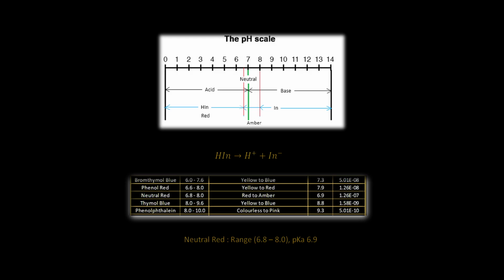By adding the titrant too quickly, there is the possibility of overshooting the equivalence point, and the test result will be an error. Therefore, the color change is the signal indicating the equivalence point. The volume of the titrant used to reach the endpoint is used to calculate the concentration of the sample. It is best to choose an indicator whose pKa value is as close to the pH value of the sample solution as was estimated by the aforementioned test with the spot plate. It is also best to add the titrant slowly to inhibit any error in overshooting the equivalence point by adding an excess amount of titrant.